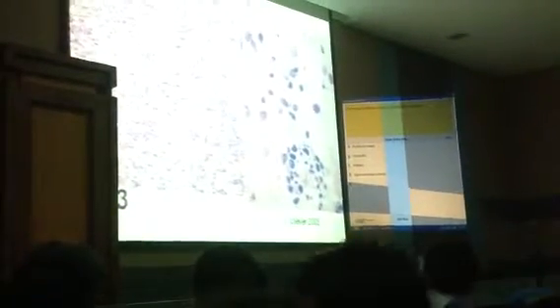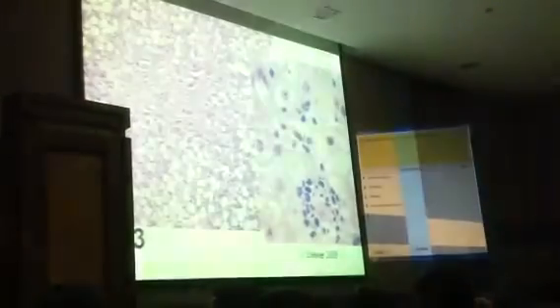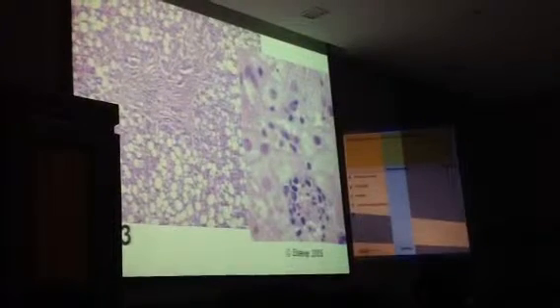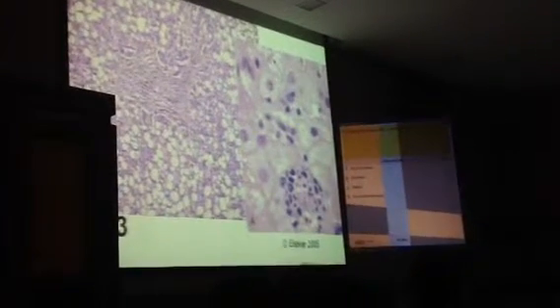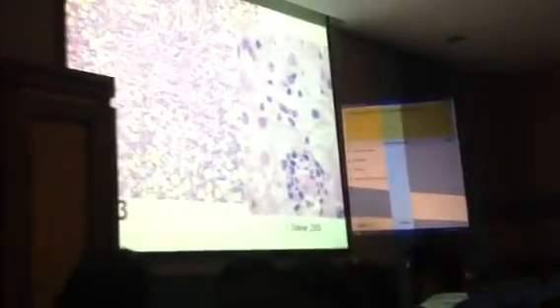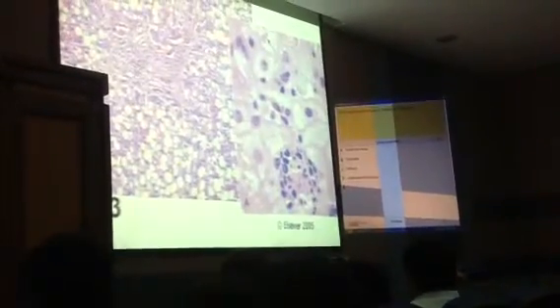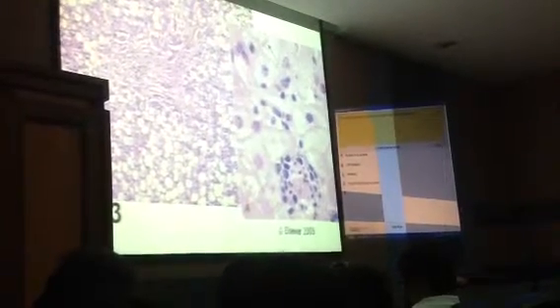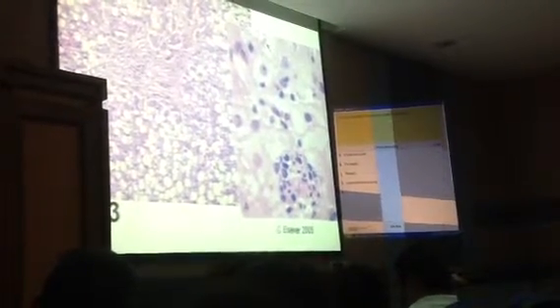22, 23. Okay, the histologic finding shown here is consistent with the diagnosis of A, alcoholic liver; B, viral; C, amoeba; or D, carbon tetrachloride poisoning. Alcoholic.